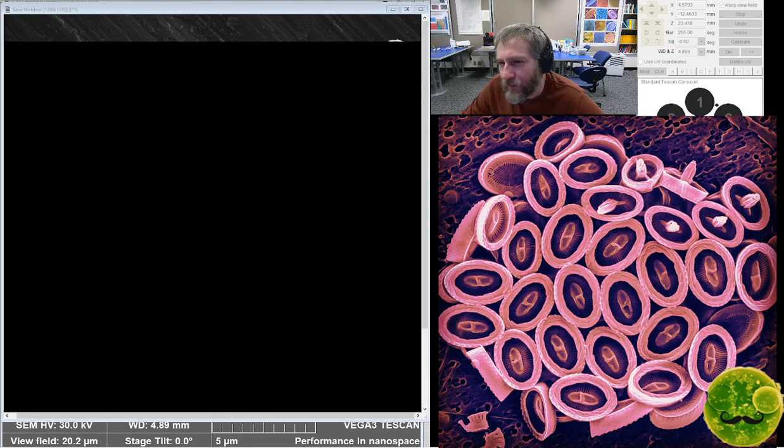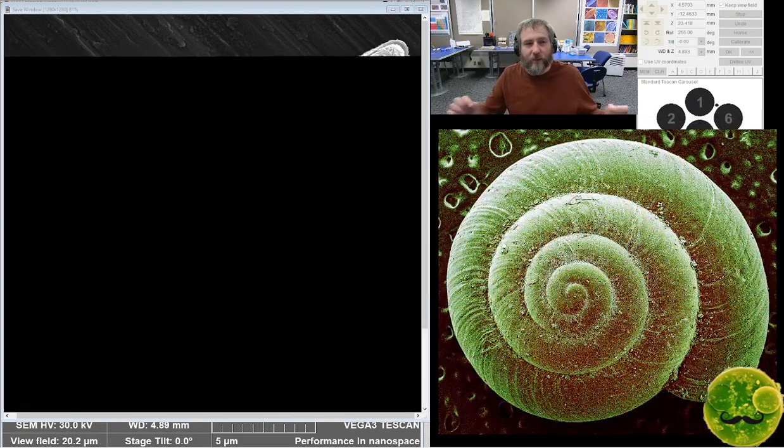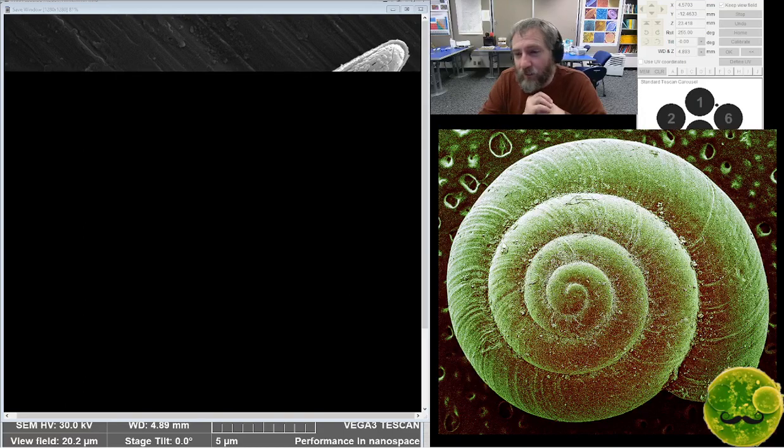What are the larger line striations? The large lines are usually a raphe, or they're just stria sometimes.